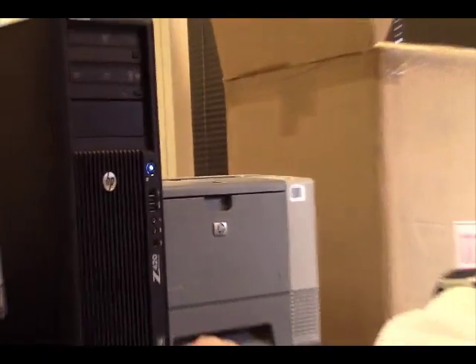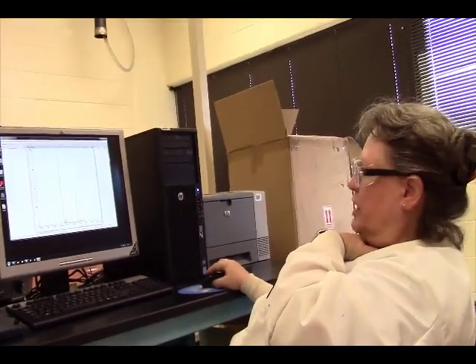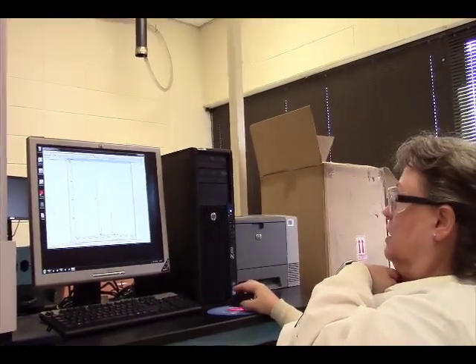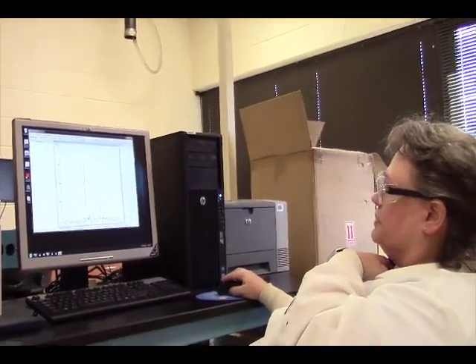Which tells me this might be dimerizing. So if I've got 2 compounds of the deuterated sticking together, and 2 of the regular sticking together, that would put me at, no, that would put me at not enough. No, it's not a dimer. I don't know what that is.